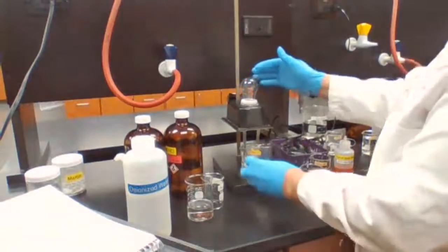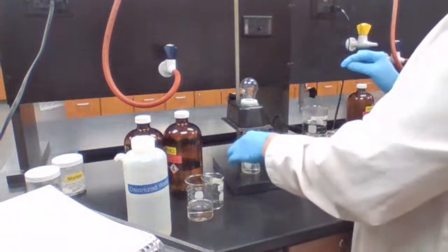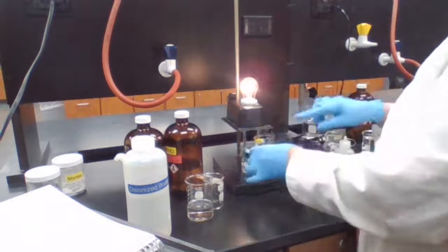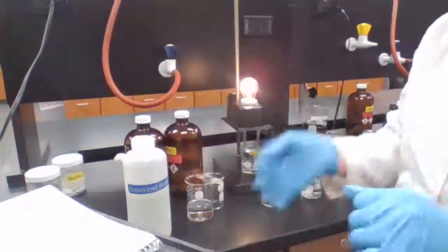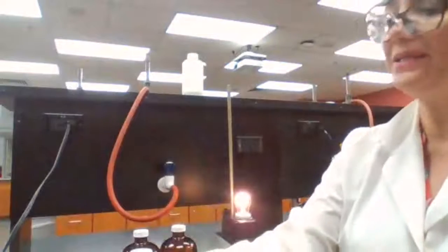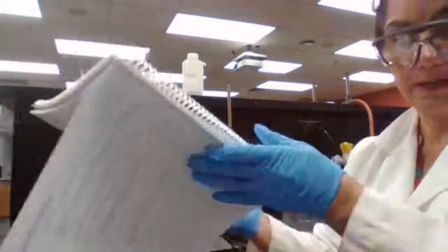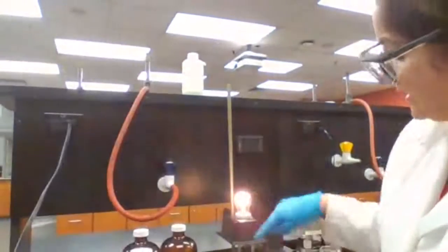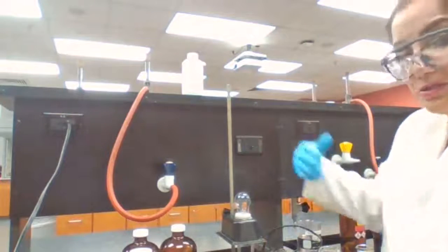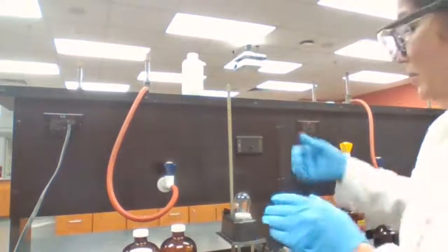What happens if we add these two as reactants? So we are adding acetic acid to ammonia. What do we get as a result? See what's happening? As I add the acetic acid to ammonia, the product that forms is an ionic compound called ammonium acetate, made of 2 ions. It's soluble because it doesn't give me a precipitate. So as a result, that is a strong electrolyte because it's an ionic compound and it's completely soluble.